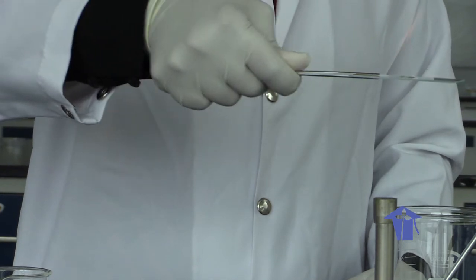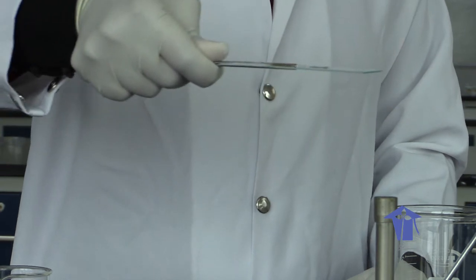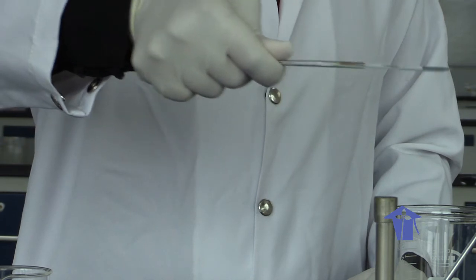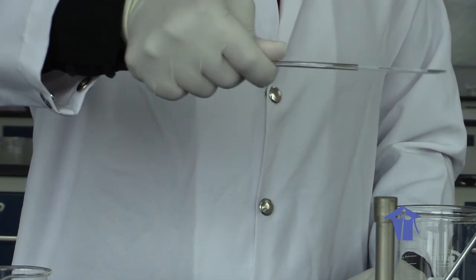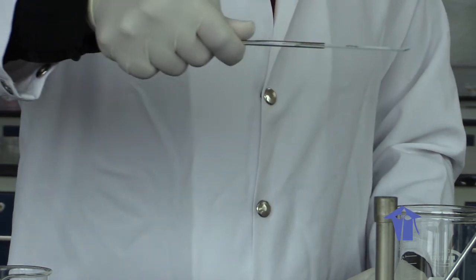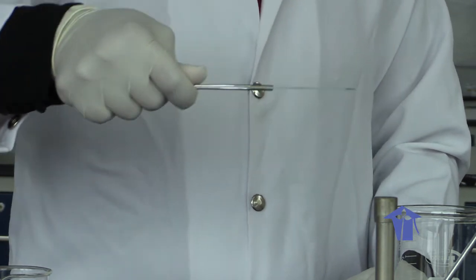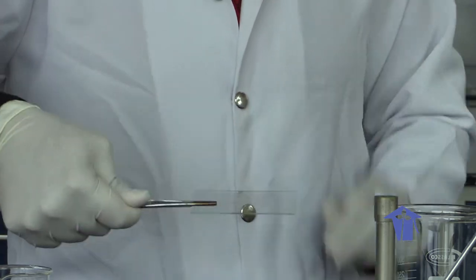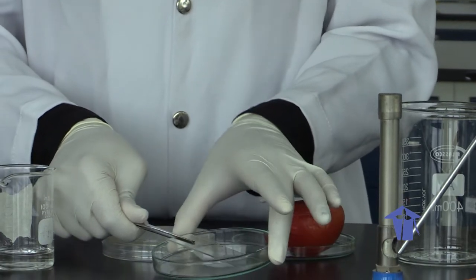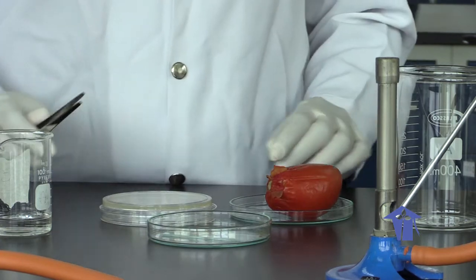As you do that, you will see the water drying up and your sample becoming affixed to your slide. So remember, with your Bunsen burner you can manipulate your flame. As you can see, the sample is almost entirely dry. You can leave it in your container, let it cool off a bit, and we're going to move across now to the sink to complete our Gram stain.